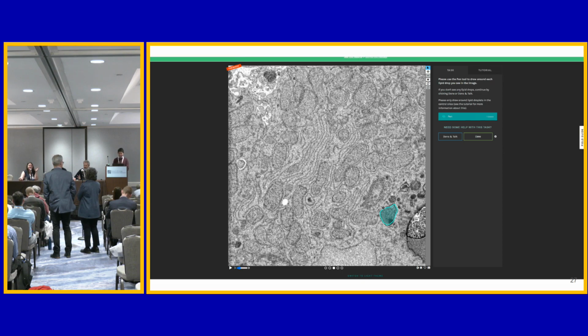Where our goal is to collect data sets that have some amount of ground truth. And that might be compound ground truth, that might be like outlines of objects, that might be like drawings of objects, but just something with ground truth so that we can use it for benchmarking. And there's, of course, things like the image data resource as well. So one of my slides that I went through incredibly quickly was a list of repositories. And this is the paper that you're working on right now that has stuff around more places to share data. So smart people are working hard on it.